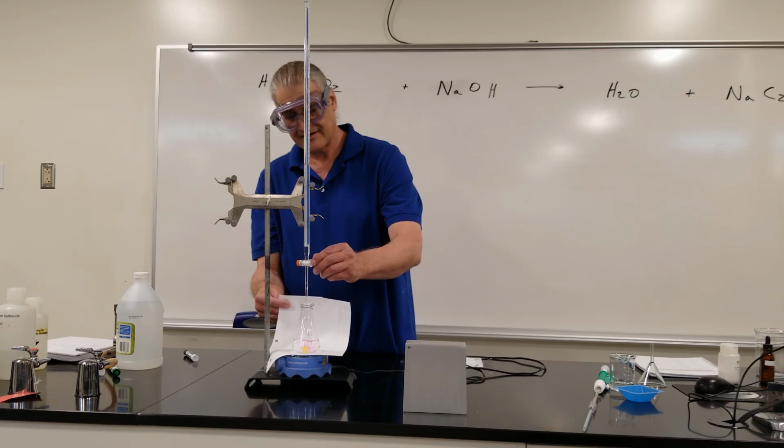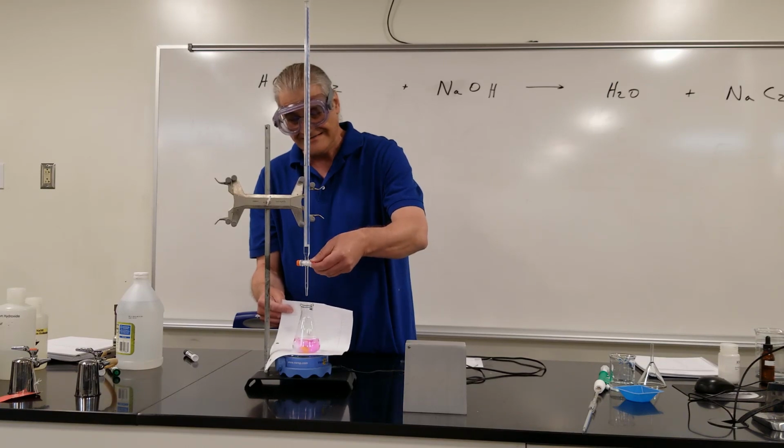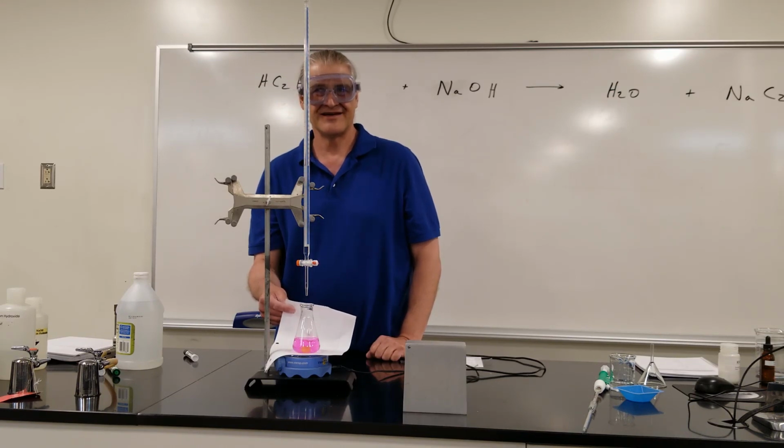We're definitely sneaking up on that end point. We're almost there. I bet you one last little, not quite. Hopefully you get the idea. You want to get to where one drop makes a difference between colorless and pink.